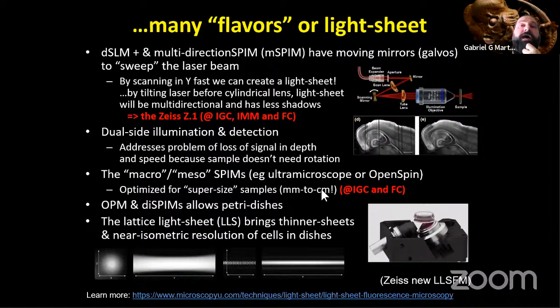In the Lisbon area, in the COLife group of labs, we actually have a total of 5 light sheet microscopes, if I'm not mistaken. So there's one at IMM, 2 at Champalimaud, and 2 at IGC.